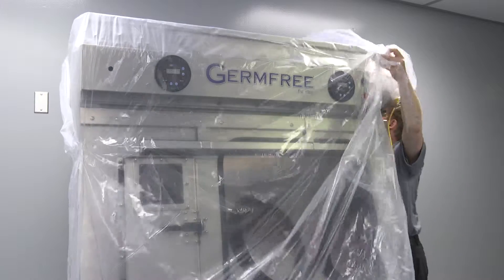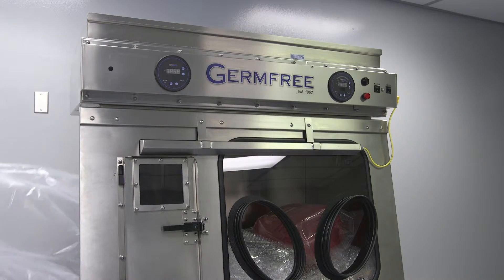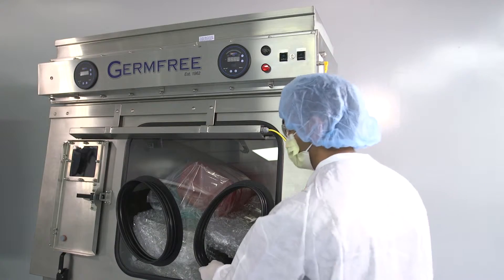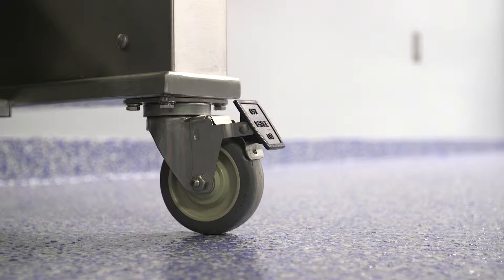To minimize the introduction of contamination, remove the shrink wrap outside of the room where the Versaflow will be placed. Roll the Versaflow into position. Once it's in place, lock the casters to secure the unit.